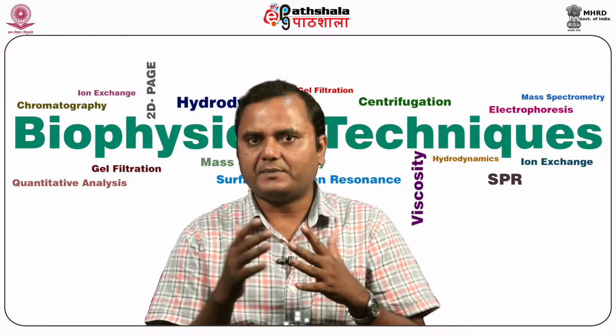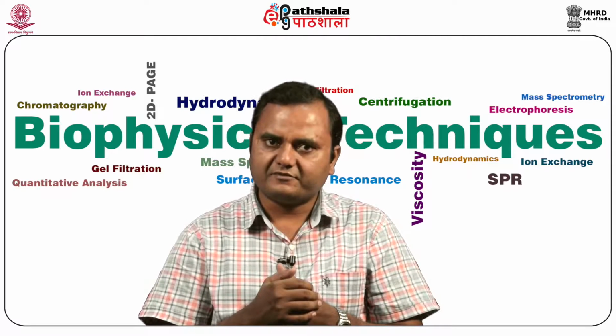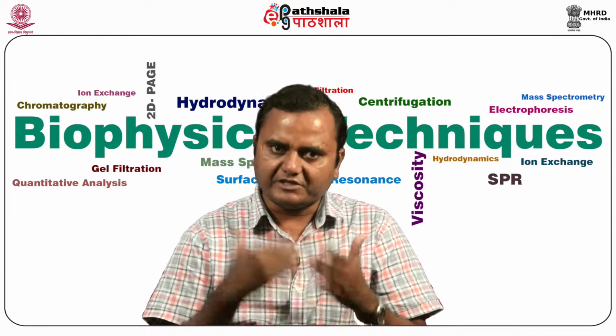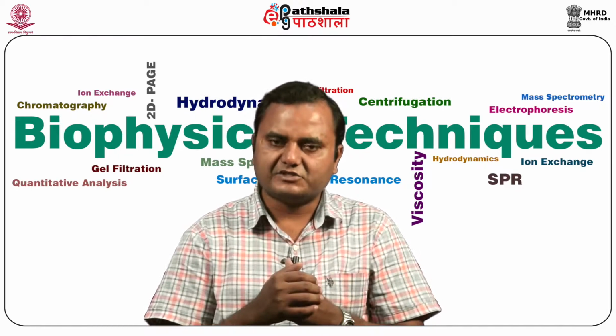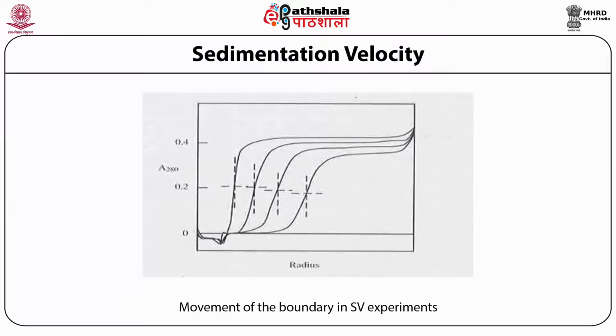So these are the two optical systems associated with the analytical ultracentrifugation technique for the measurement of the dynamic picture, for the measurement of molecular mass and other biological features of a particular molecule during the ultracentrifugation process. Now you can see here in the figure that the velocity of an individual particle in the sedimentation velocity experiment cannot be resolved, but the rate of movement of the boundary region can be measured. From this, the sedimentation coefficient can be determined.